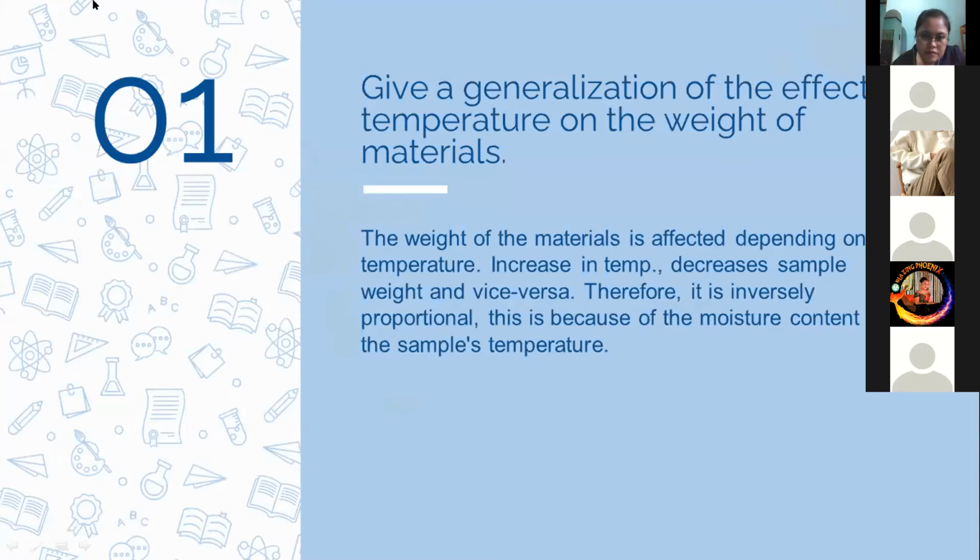Give a generalization of the effect of temperature on the weight of a material. Increase in temperature decreases the sample weight and vice versa. Kung mag-decrease ang temperature, mag-taas ang weight sa sample. Therefore, we can say that it is inversely proportional.